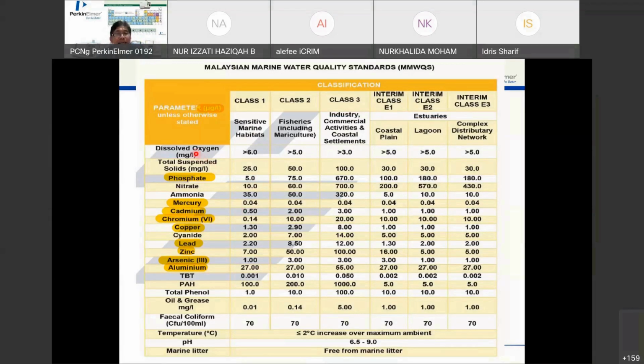All are basically at the ppb level. But look into it, marine water is very different because it's a complex sample. All sorts of sample matrices are there: high sodium, high calcium, high potassium, high magnesium. They are in percent.